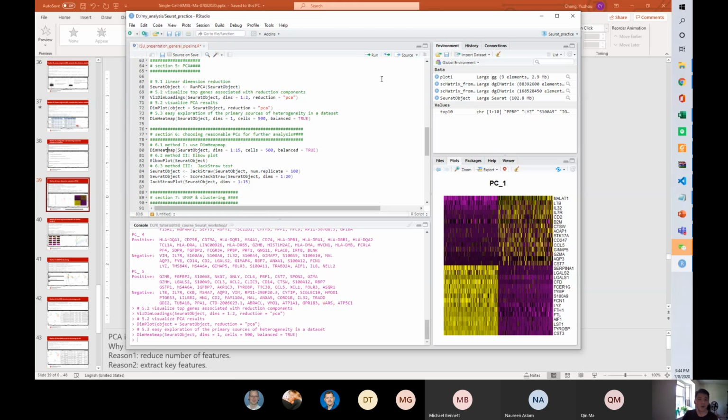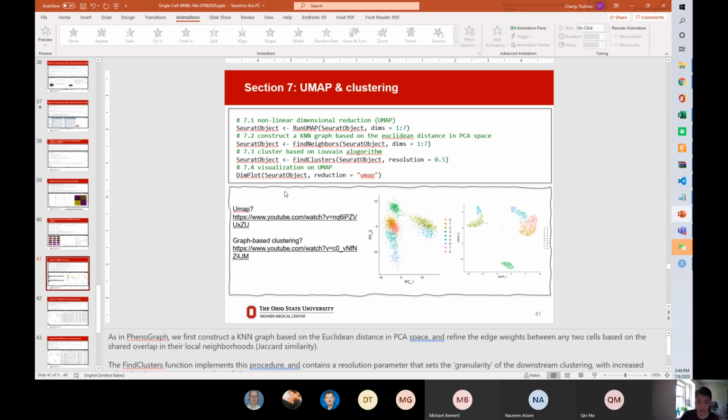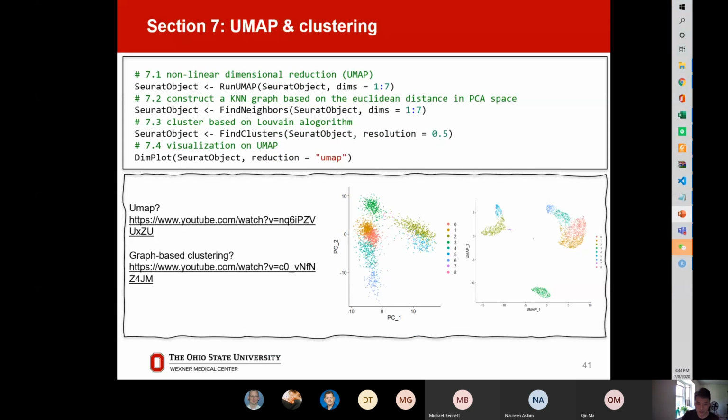Okay, so after we run the PCA, we will get another matrix. Sorry, I didn't put this matrix into the slide, but you can imagine the gene-cell matrix, the cell in the column and the gene in the row. But after running the PCA, we got a brand new matrix in which the principal components have a score.